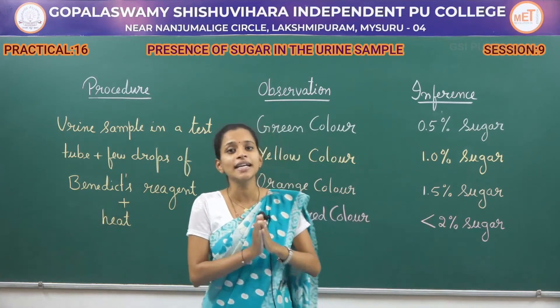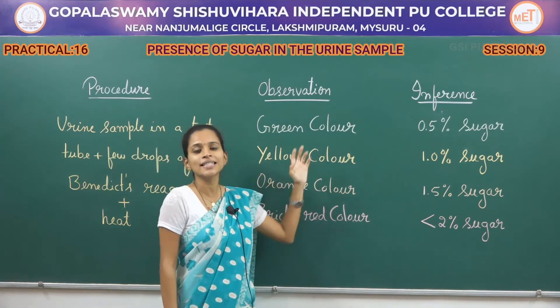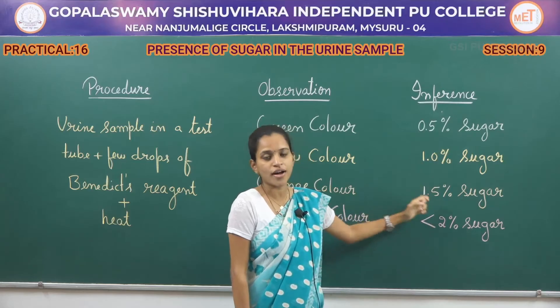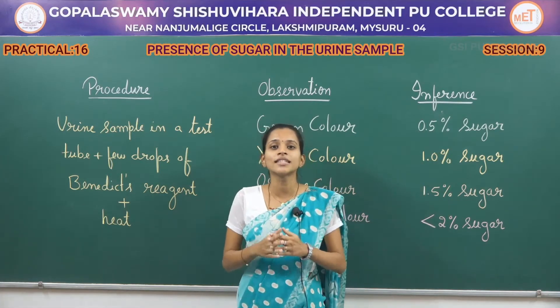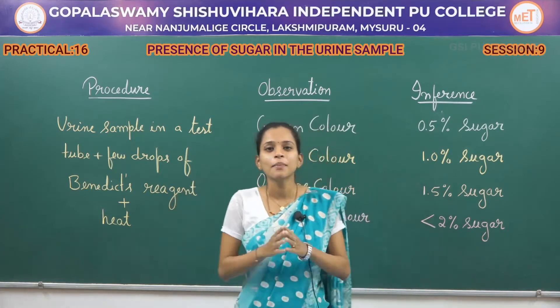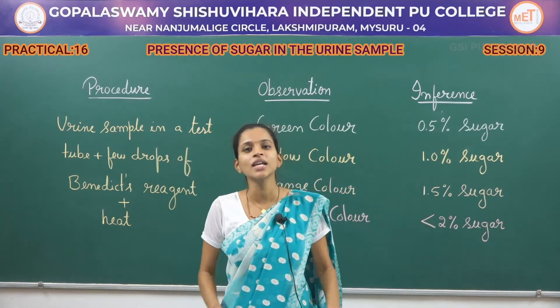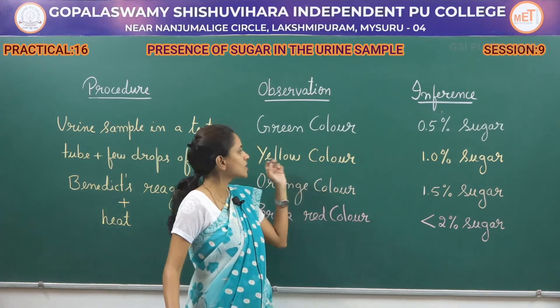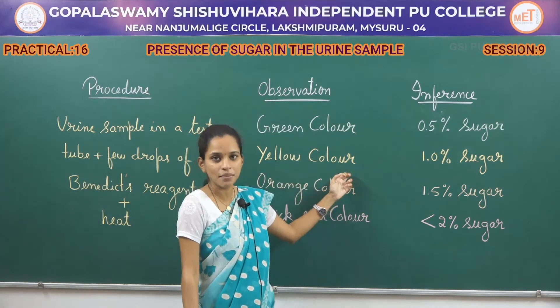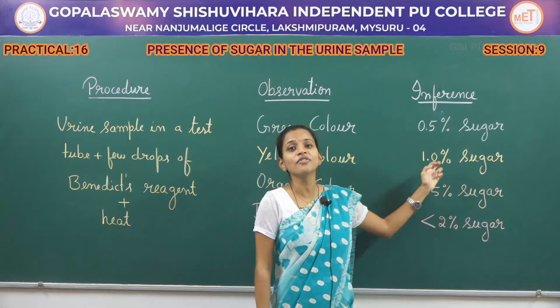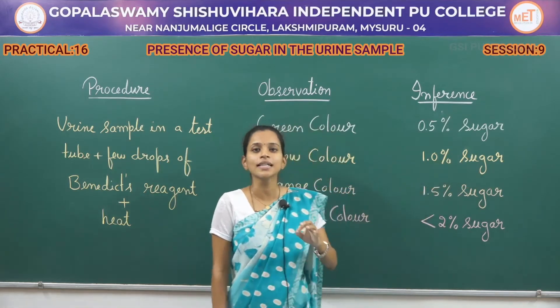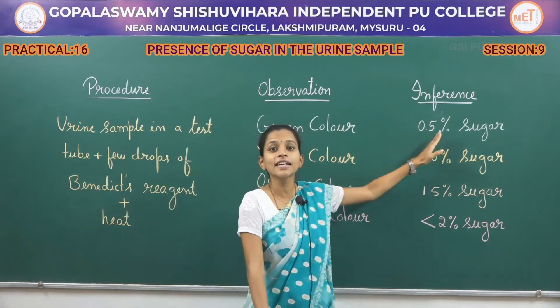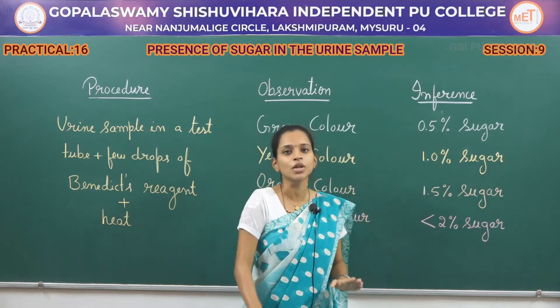While you heat, if the colour retains at any one position, it indicates the presence of sugar at either 0.5%, 1%, 1.5%, or more than 2%, based on the colour remaining in the test tube. For example, if while heating the test tube shows yellow colour and retains that colour, it indicates the sugar content is 1% in the given urine sample. So if the colour retains at any one stage, it indicates the respective percentage of sugar.